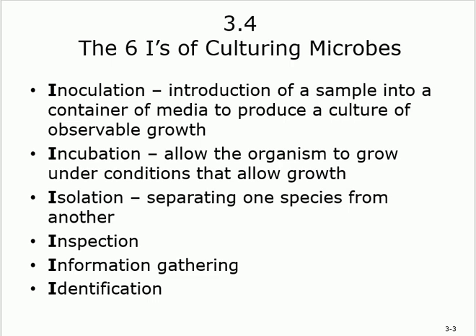And then you're going to isolate if it is more than one species, and then you inspect it, gather the information, do the analysis, and at the end, which is what we actually need, and that's why we're doing all of this, to identify. Tell me, what is this?